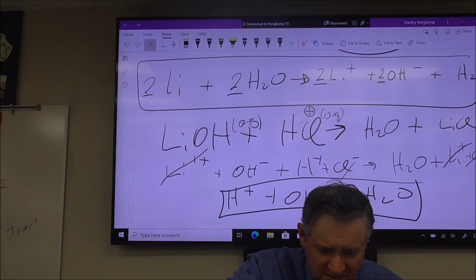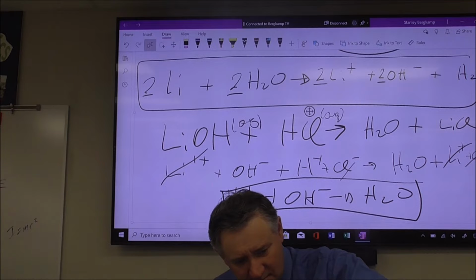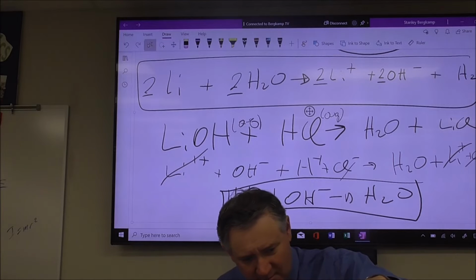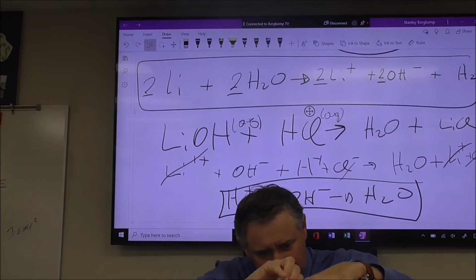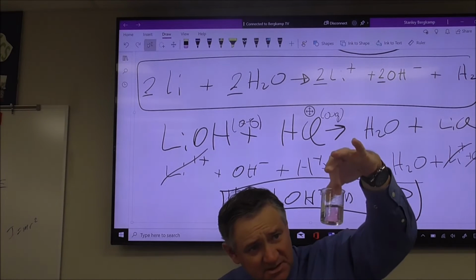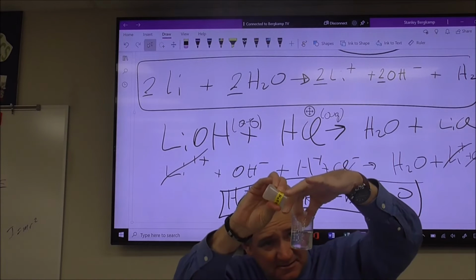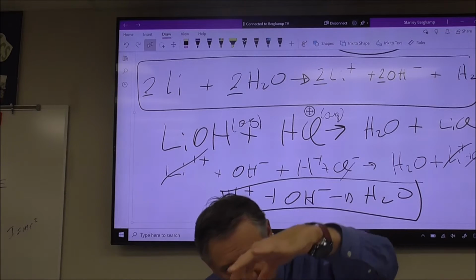The longer it takes to fade out, that's the closer you're getting to it being basic. Oh, come on. It's kind of gross, you can see it swirling around in there. There we go. Okay.